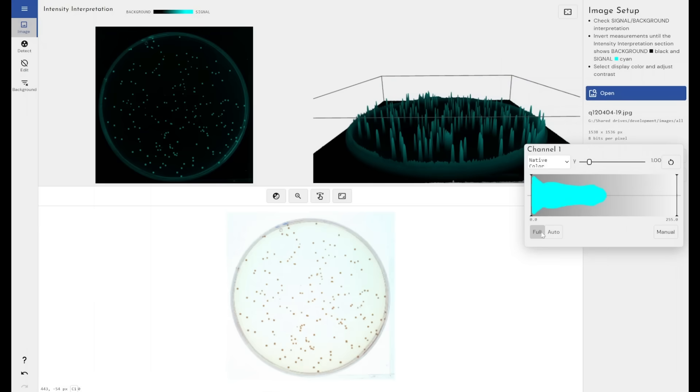We do perform an automatic contrast and brightness adjustment when we bring images into the software that the user is not aware of. But that's not always perfect. So you do have these options to override that to try and get the best view for yourselves.